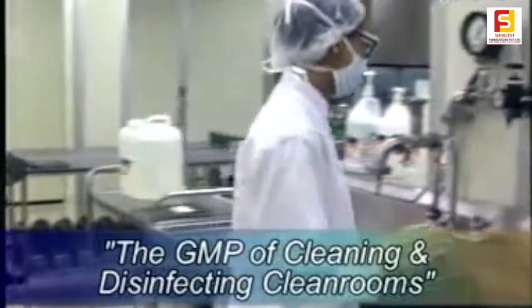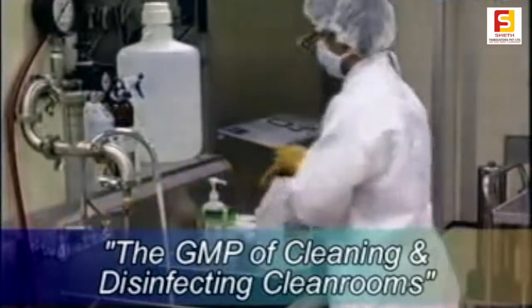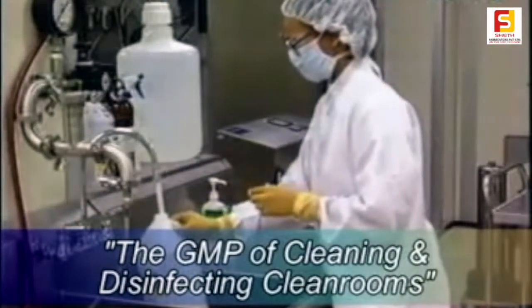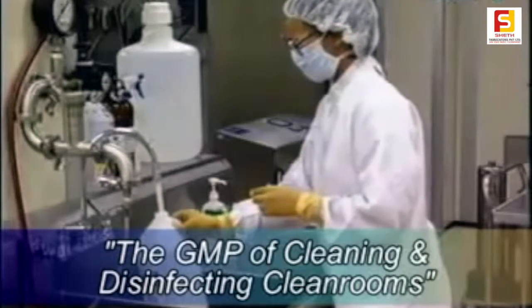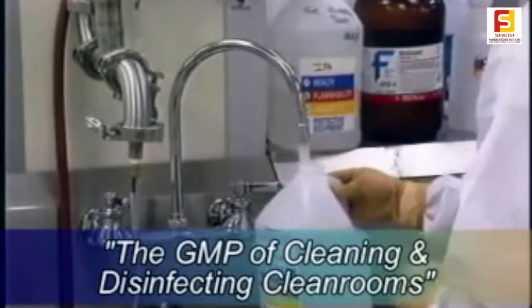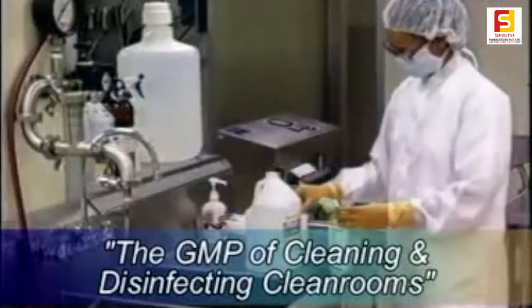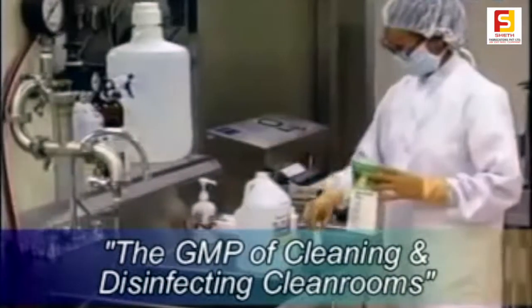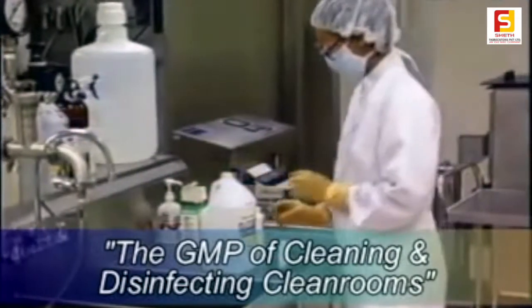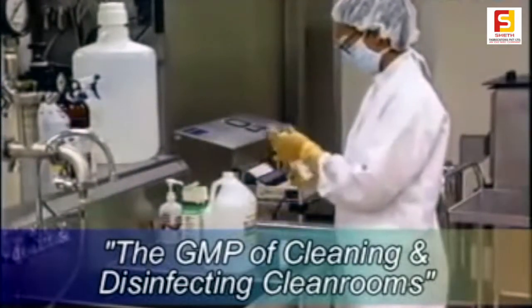The water to be used should be either water for injection quality or freshly filtered demineralized water. Firstly, the water required to mix with the cleaning agent should be measured. Next, the exact quantity of cleaning agent for the amount of water in the container should be measured and added to the water.